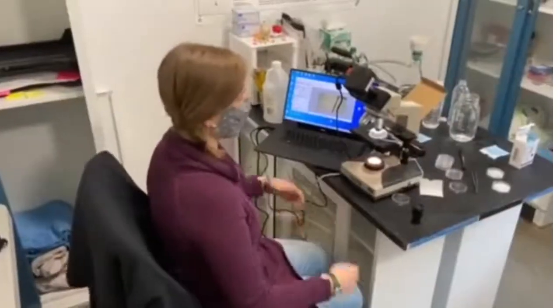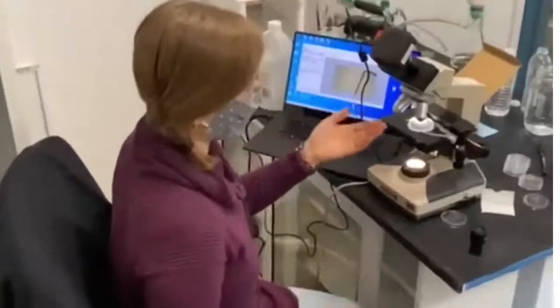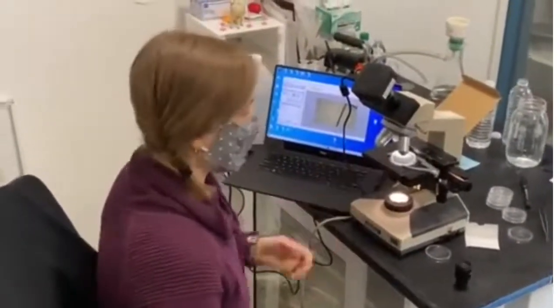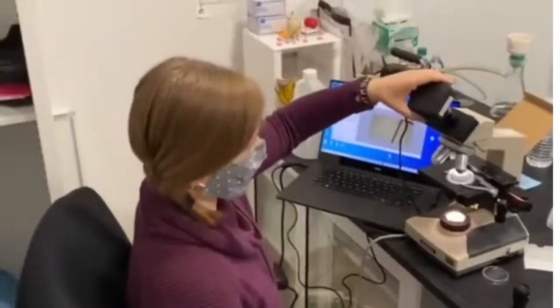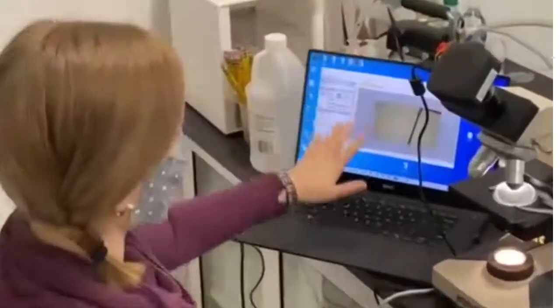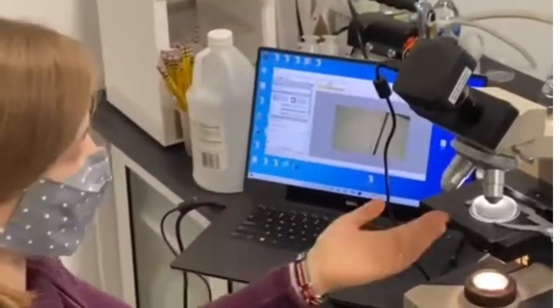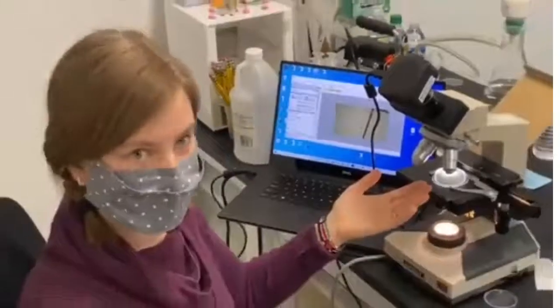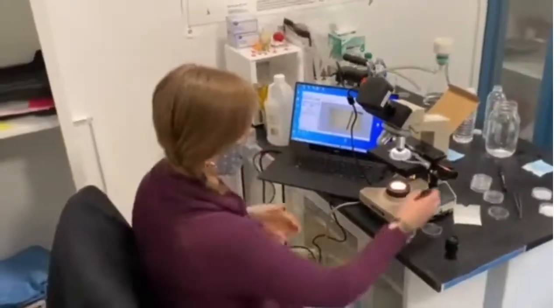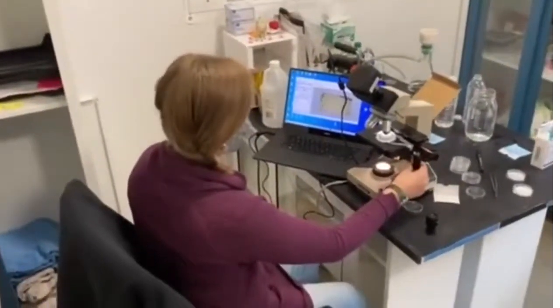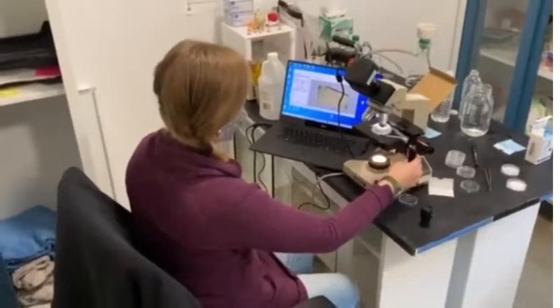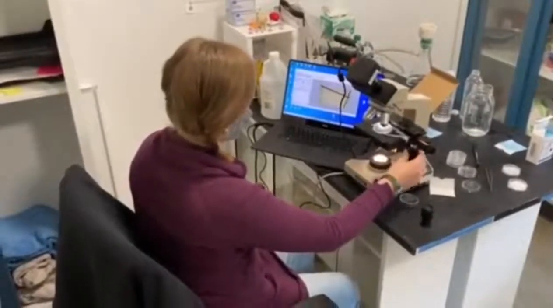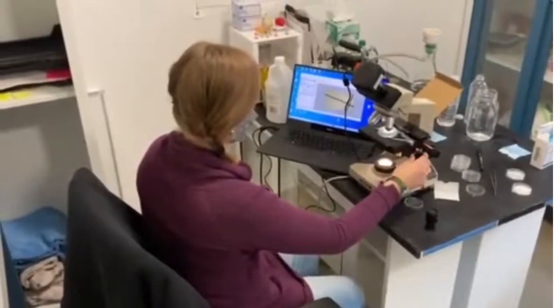Now we're over at our microscope. We have our first sample ready to view and we also have a camera hooked up to our computer so that whatever we can see underneath the lens of the microscope we can also see on our computer. We can scan the gridded filter paper to look for microplastics.